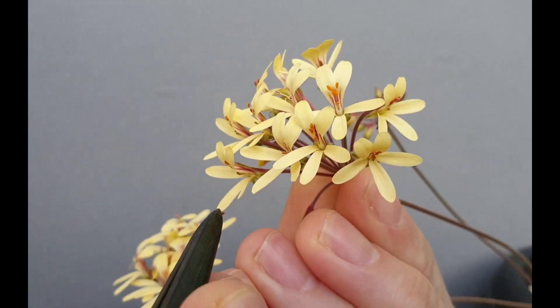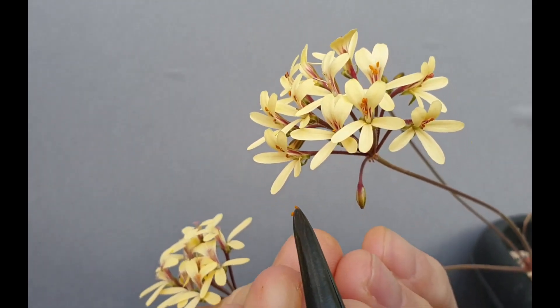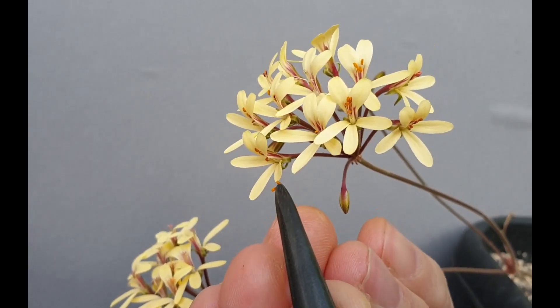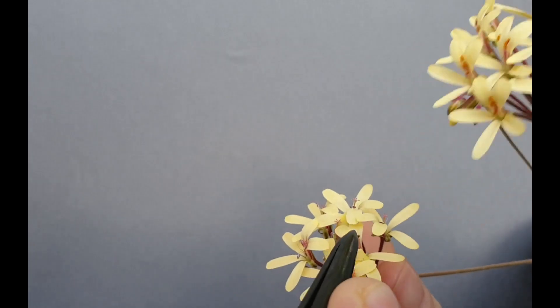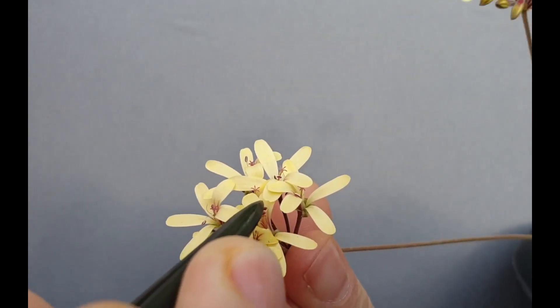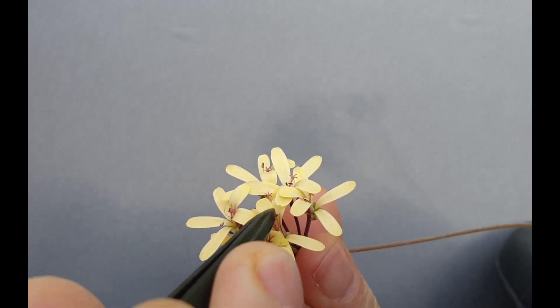This is a slightly fussy part of this work. I've got two anthers in my pincers now, and what I'll do is transfer the pollen to a stigma and brush it off lightly.